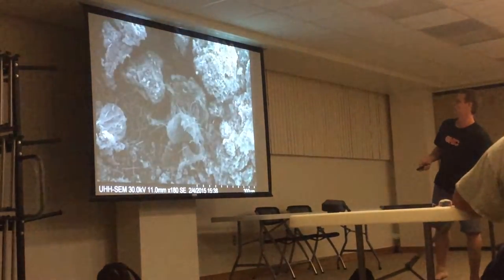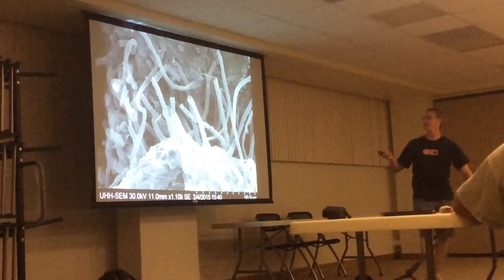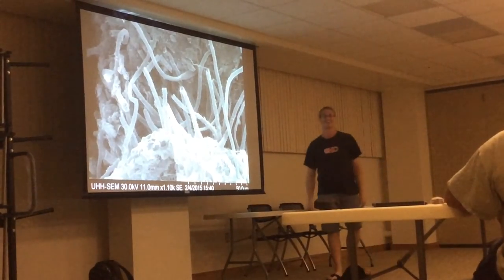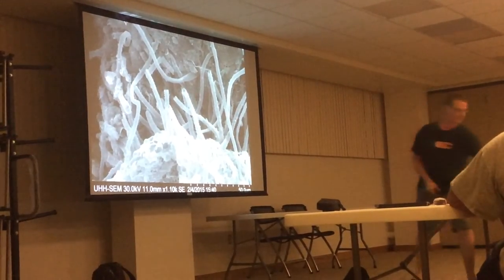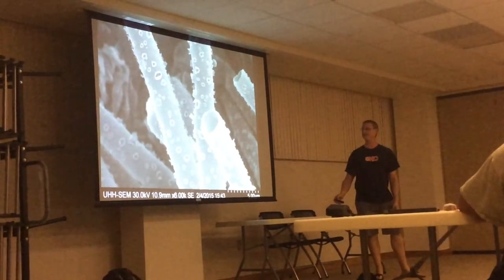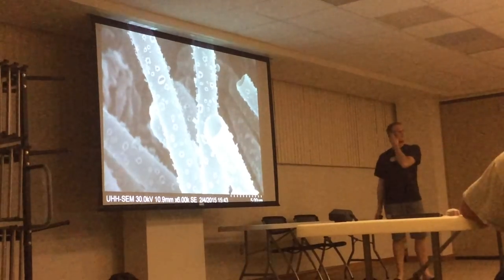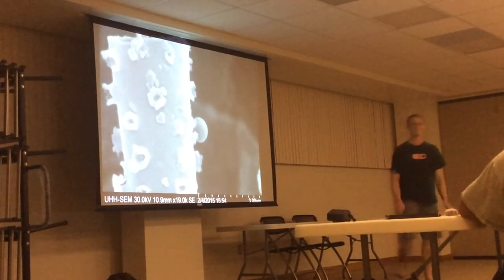Actinomycetes with hyphae. Here's a great one that looks like it's underwater. I don't know yet - I showed that to Jason and he's just like, I have no idea. Algae? Don't know. It has wonderful structures - looks like coral or something. Do these release gases on the side? What are the functions of these holes? Is it to gather and pick up stuff? I don't know. Bacteria is stuck to the top - and maybe that thing pulls nutrients off of a piece of bacteria. I don't know - I love the wonderful question.